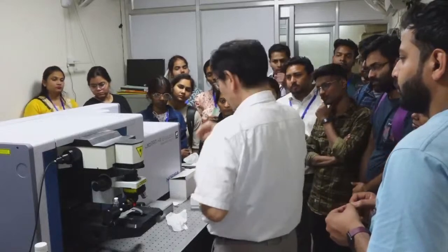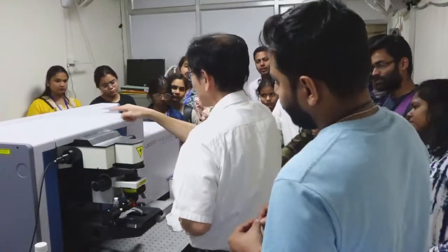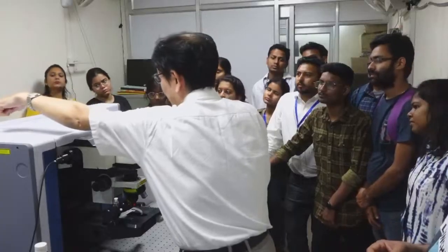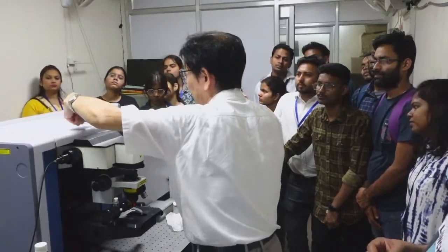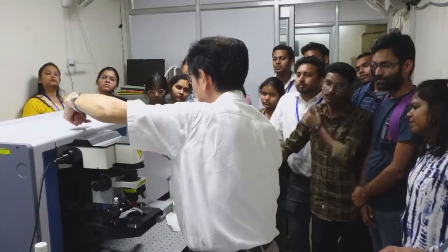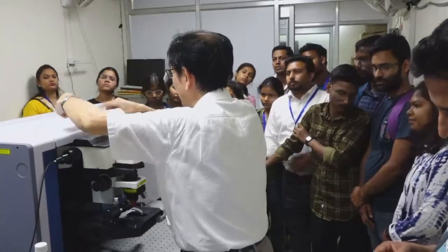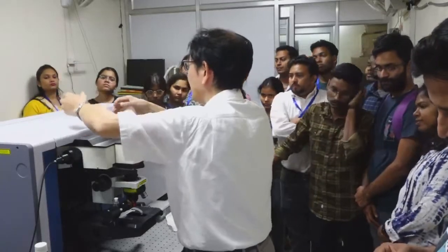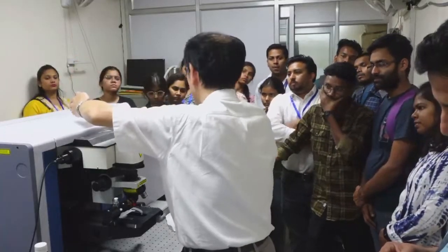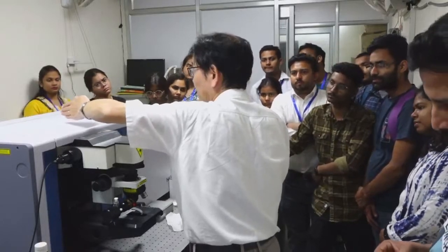Okay. Then the backscattering comes back to the box. The laser line excitation beam comes from this side, and the Raman signal goes back. How can we separate them? We put one optical element here. That is a dichroic mirror, a two-color mirror.